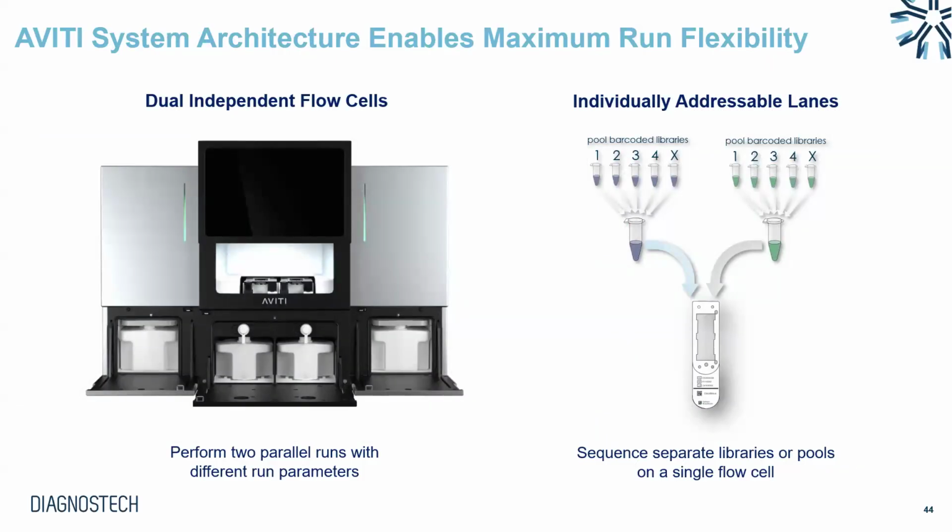As I've mentioned, they designed the system with flexibility in mind. So I've already mentioned it's a dual-sided instrument, but the flow cells have also been designed to be dual-sided in a sense by allowing for individually addressable lanes. This can happen by the press of a button.